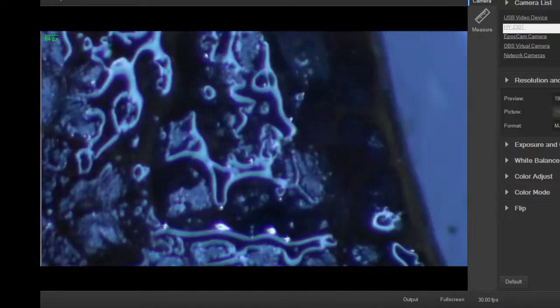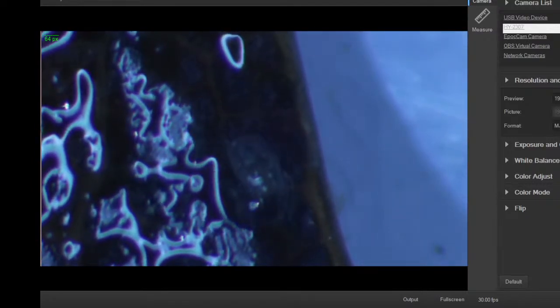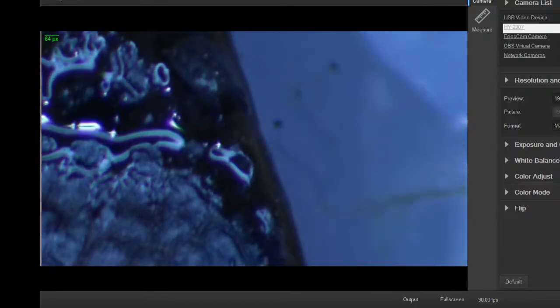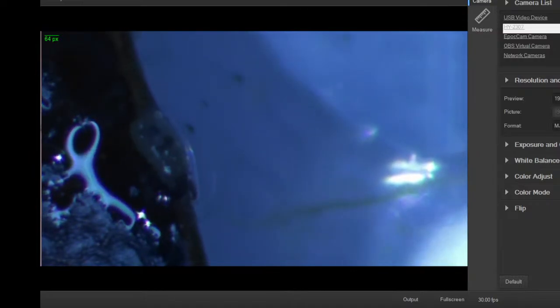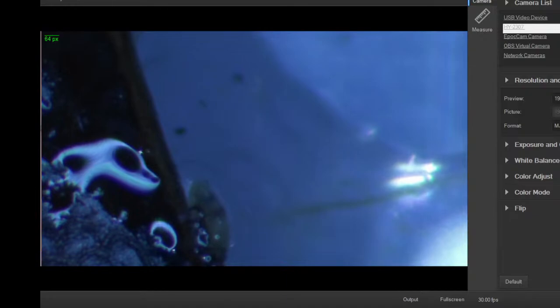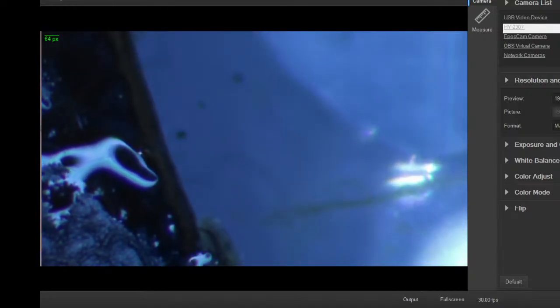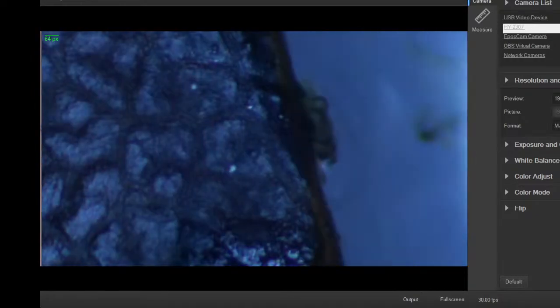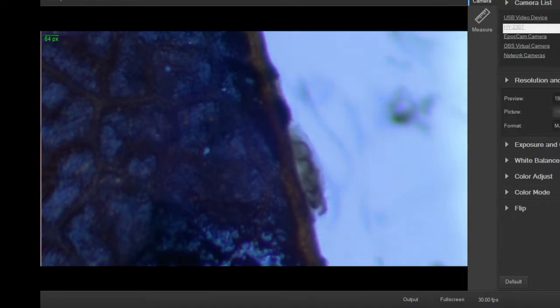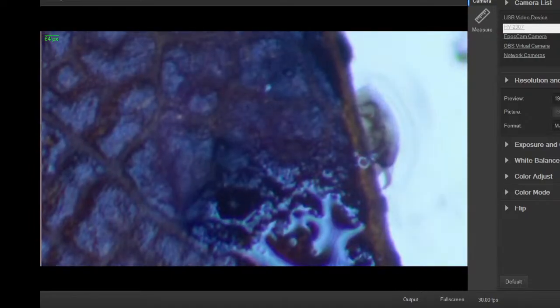But let's turn off the transparency. Get the top lighting. Looks very tick-like now. It's actually a tick and not a mite.